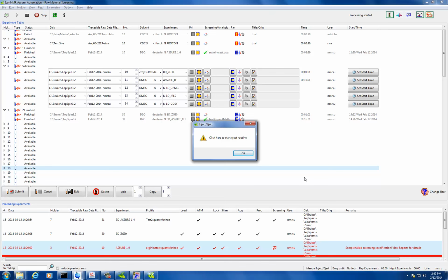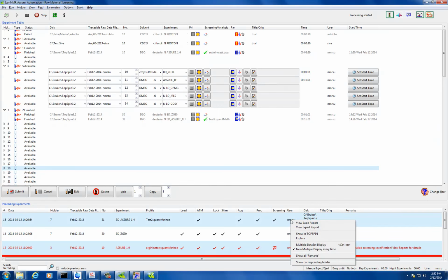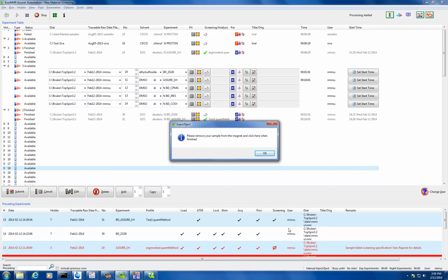Okay, so that's done. Let's click OK. So you see that screening is done. Let's right click on that and go to expert report. I've got to remove it. Yeah, I got it. It's easy.